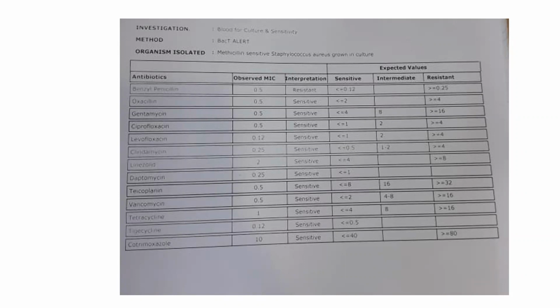Similarly, this is about the gram negatives. Similarly, gram positives, there is something called hemolysis. So alpha hemolytic, beta hemolytic, there is a tinge, let's say the greenish tinge due to the hemolysis or zone of clearing. There are others like gram negatives, there is a swarming that is characteristic of a Proteus. There are some bacteria which have a typical smell. So all these tests or the features of different bacteria can give you at least an early identification.